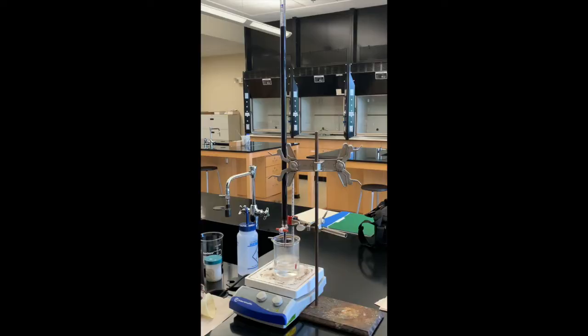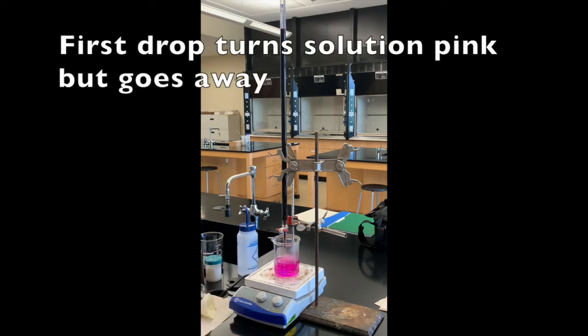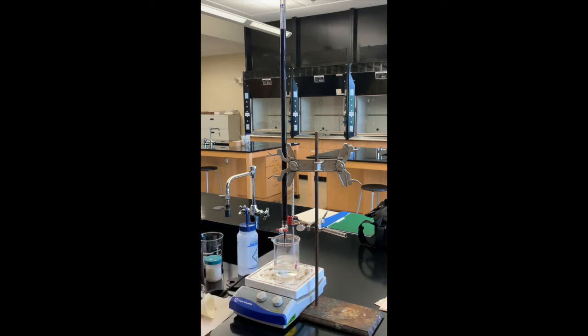I have refilled the burette for trial three and for Part C. The initial volume for trial three is 0.76 milliliters. My temperature is about warm enough so I'm going to start titrating. That pink color staying that long might be because I didn't have the temperature quite warm enough — it's about at 57 degrees, still warming up to about 60 degrees, so I'll continue titrating.